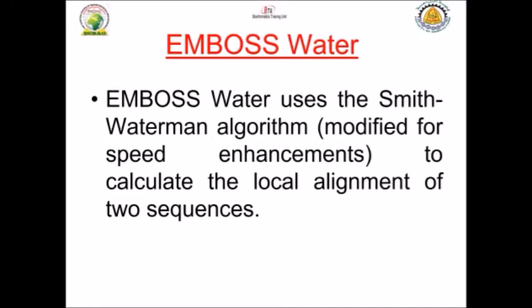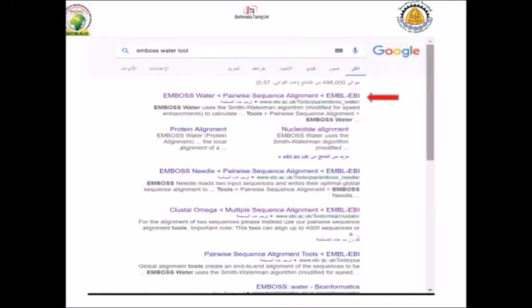There is a very useful tool called EMBOSS Water. EMBOSS Water uses the Smith-Waterman algorithm, which is modified for speed enhancement. This can calculate the local alignment between two sequences. As we said, it's very easy to find — you can just type in Google 'EMBOSS Water tool' and the first hit usually comes up.